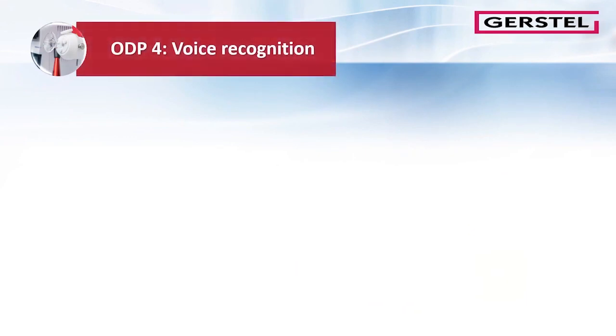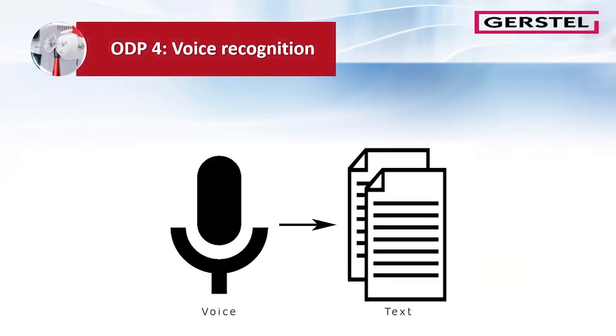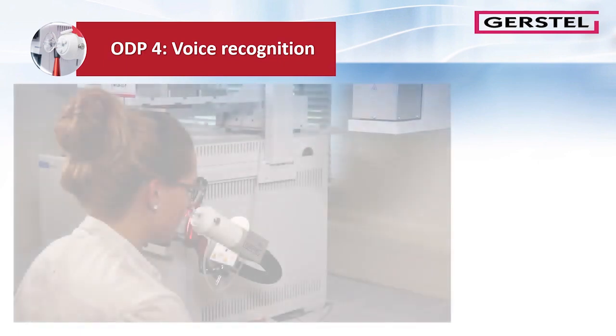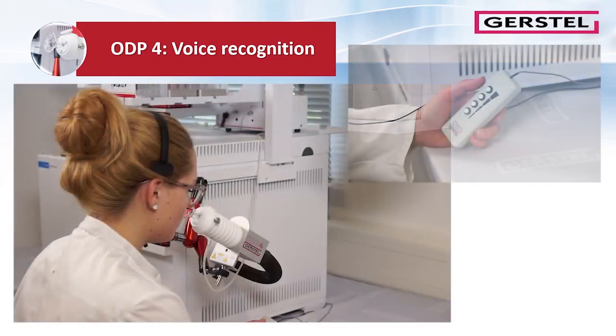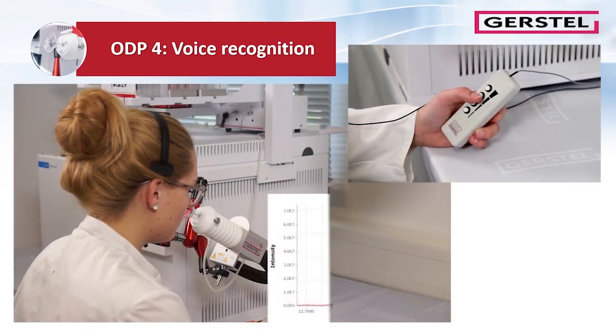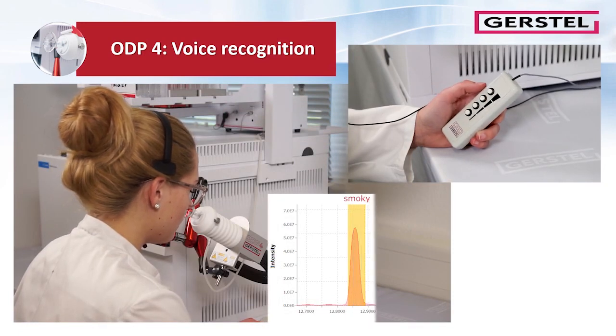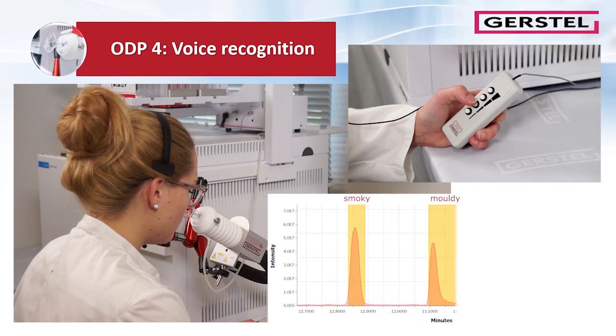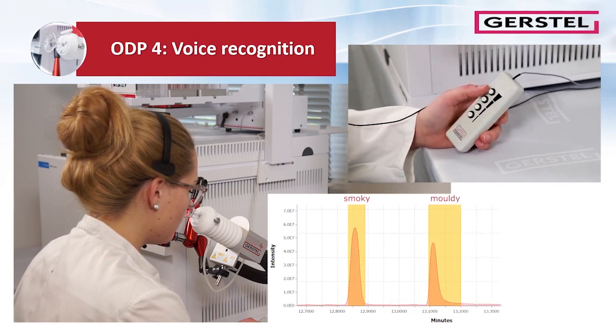The voice-to-text feature allows distraction-free, eyes-closed operation. No distraction sliders, color-coded buttons or descriptor templates are needed. Voice-to-text technology is used to produce descriptors directly from the analyst comments during the olfactory session. Smoky, moldy, vanilla. The comments are stored in order to clarify descriptors if needed, and all descriptors can be modified within the report when necessary.